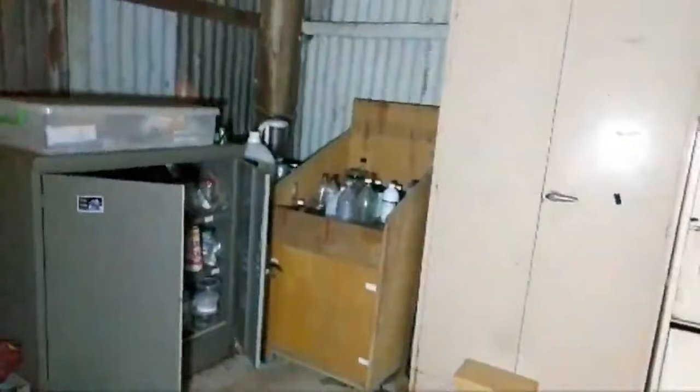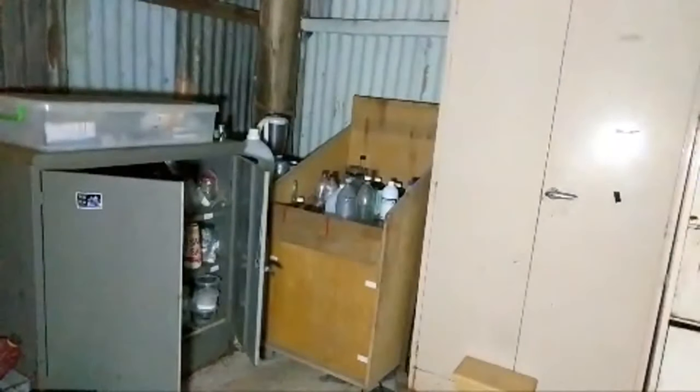Does this light work? Nope. Okay, what do we need? Who's doing the size for me here? Iron something. Yeah, what do we need? Iron oxide? Would iron oxide work? Let's have a look, unless anyone has a different idea, like calcium carbide.